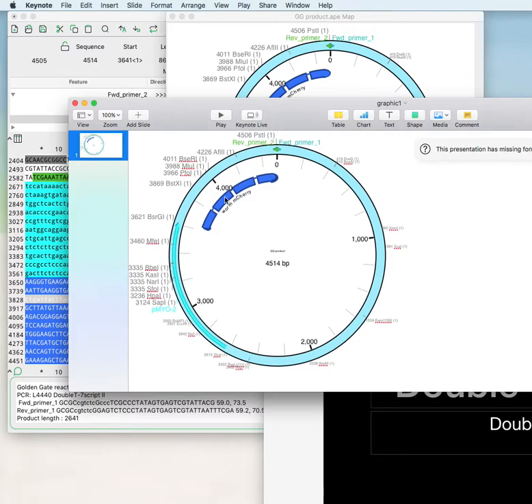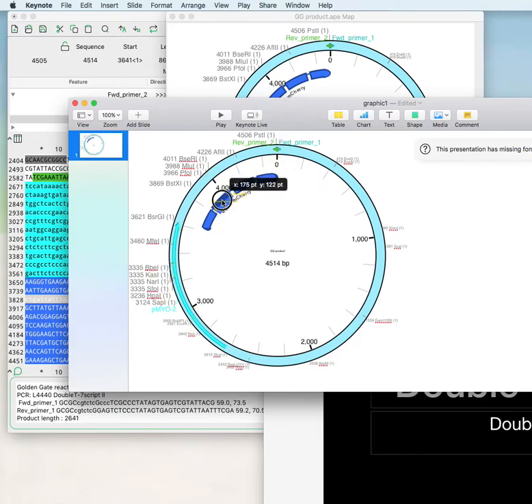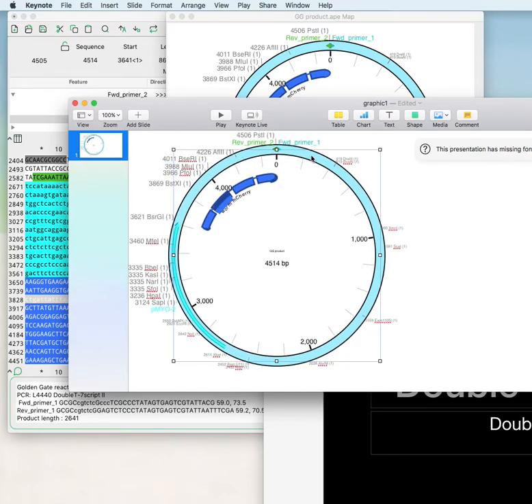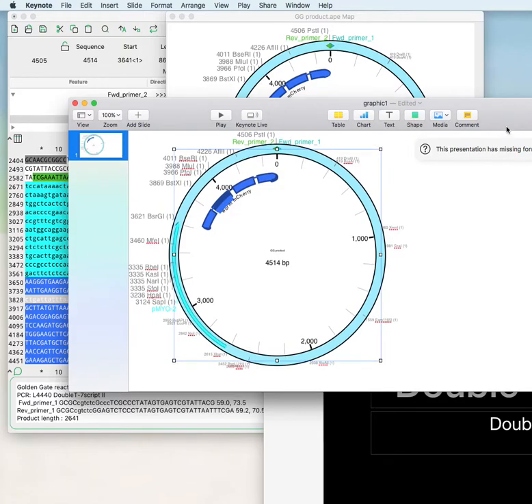It's not saving it as a vector graphic, but it is saving all of the individual elements, so they can be moved around and edited individually within the presentation.